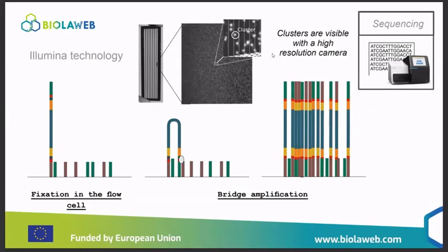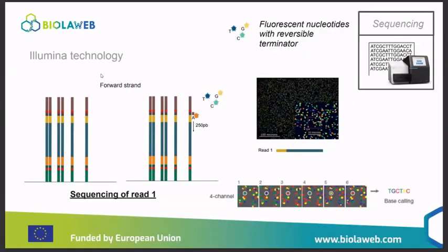And why you do those clusters is that you can now see your cluster using a very, very powerful camera. And so yeah, it's the basis of Illumina sequencing. Then it starts to sequence the first read.